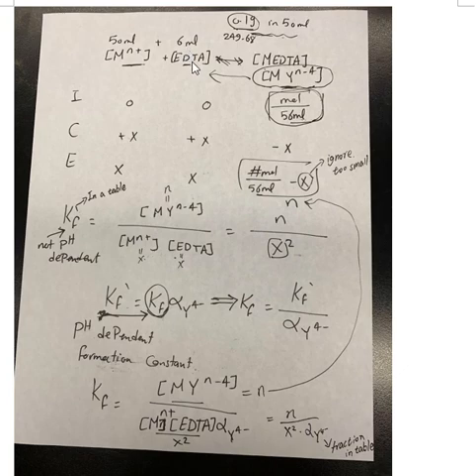Here we assume we use 6 mL, and we also assume the starting point after the titration is done, everything is gone, the reagents. We start from the product, the complex. It goes this direction. It's a reversible reaction. We assume we start from the complex, and here the starting concentration of the complex is mole divided by 56. Remember, we assume this 6 is 6. You use your real number after you are done with your lab. So 50 plus 6, 56, and the mole.